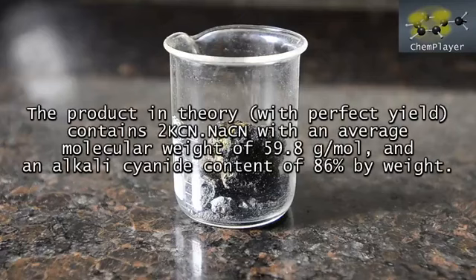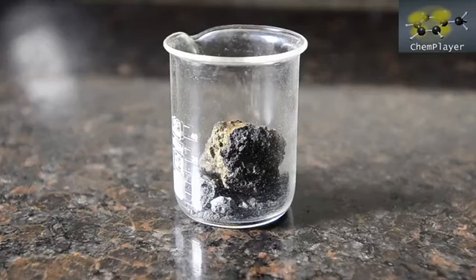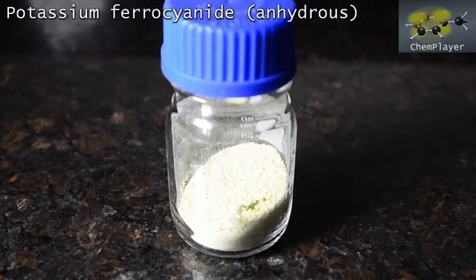There's a small amount of cyanate and hydroxide impurity as well. There are other ways, but we've found that in order to do any sort of organic synthesis you need a fairly pure product, and it's difficult to get with other reactions. And yes, they're deadly. Take full precautions and don't even think about trying to kill yourself with them. It ain't pretty.